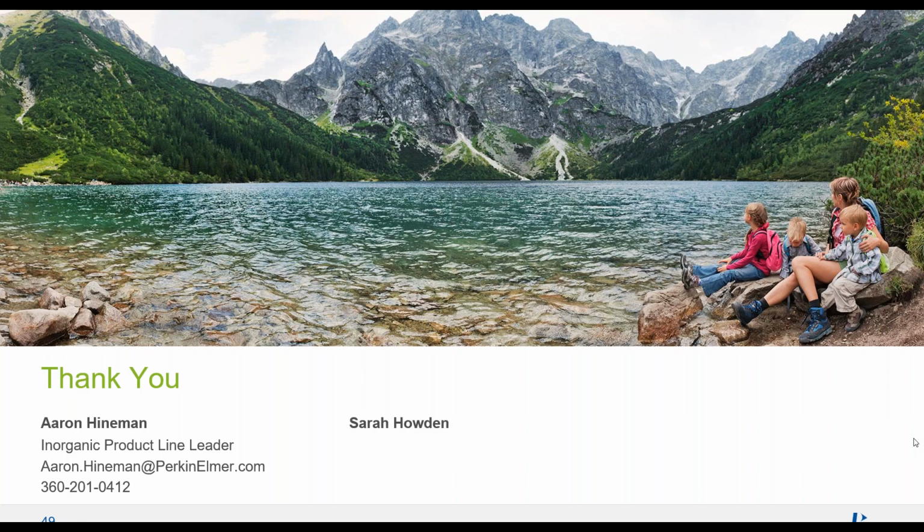Sarah, do you have any other recommendations? Again, the type of samples you're running and how often you're running will determine the frequency. Of course, it's better to clean it more often than you need to than not enough, because if you wait till it gets really dirty, it's going to be very difficult to clean. You want to be very careful with the slot of the burner head.